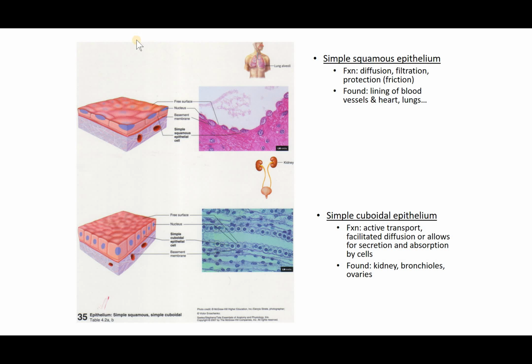Okay, simple squamous epithelium. For these, you'll want to know the structure itself. So there it is, simple squamous epithelium. Its function and where it's found. For all the tissue that we're going to look at, those are test questions: the structure itself, its function, and where it's found.